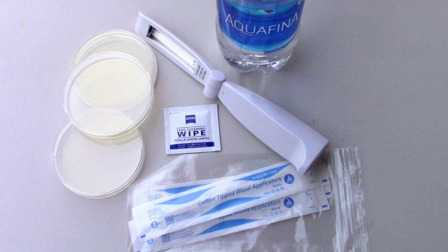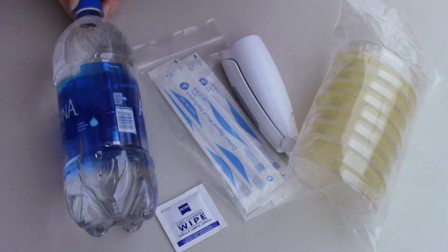And then we have this little wand here that is a UV light that I actually got at the dollar store. So you can see here how many Petri dishes you get and that the UV light folds up, so that's nice and compact. I will say the negative thing about this, a Dollar Tree store, $1 pretty good, but it does require batteries, I would say is the first con. So there's going to be some waste there, some expense there. Though I have a larger wand that I think I got off of Wish or something forever ago that plugs in UVB. So there are a lot of different options out there. We'll talk about the pros and cons as we go.